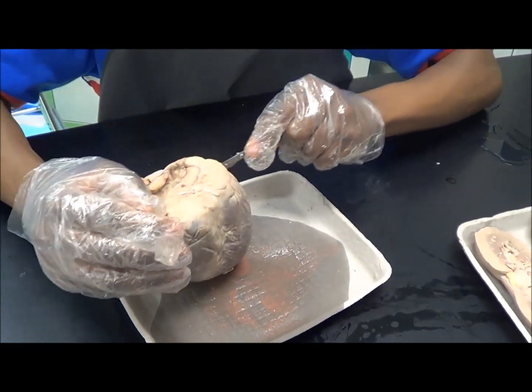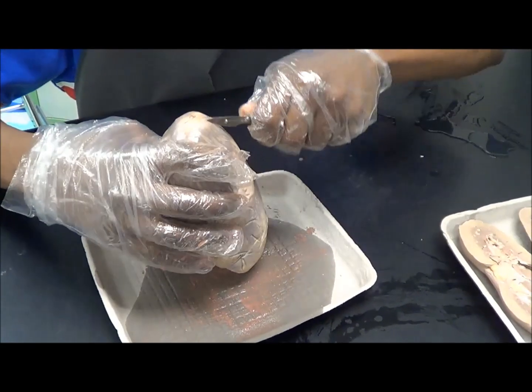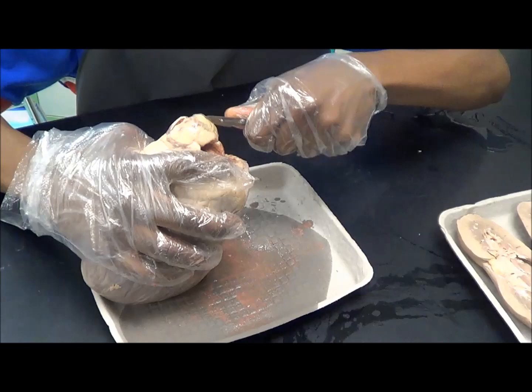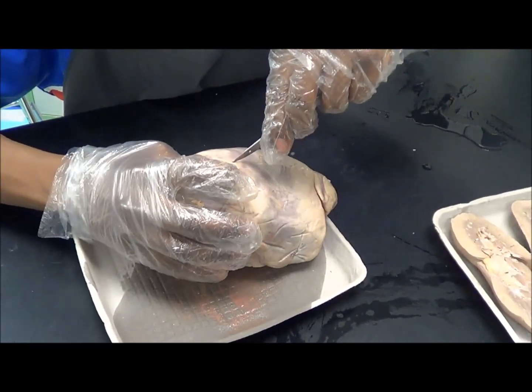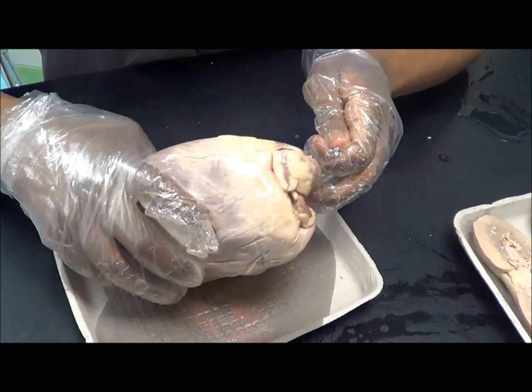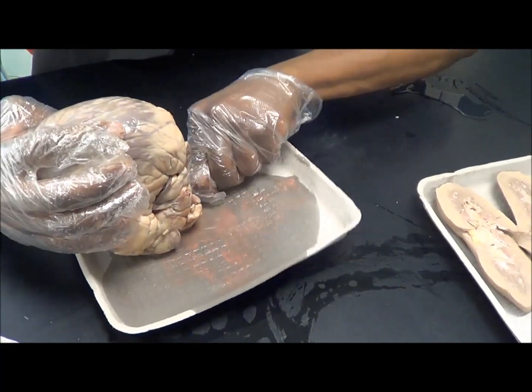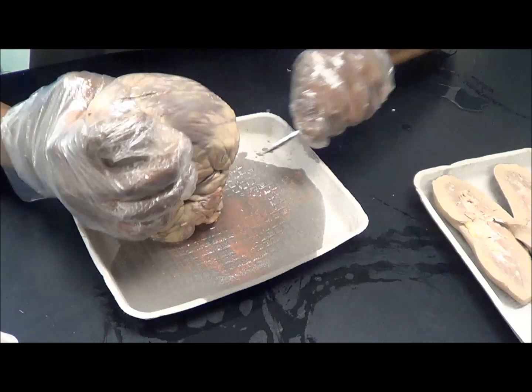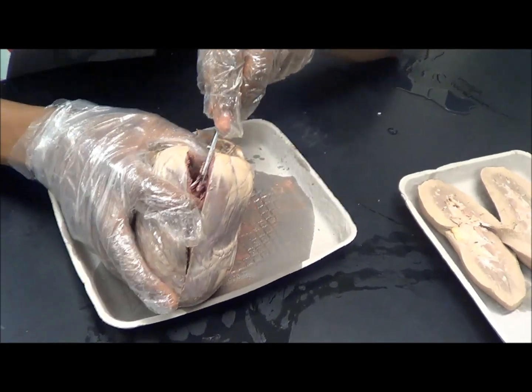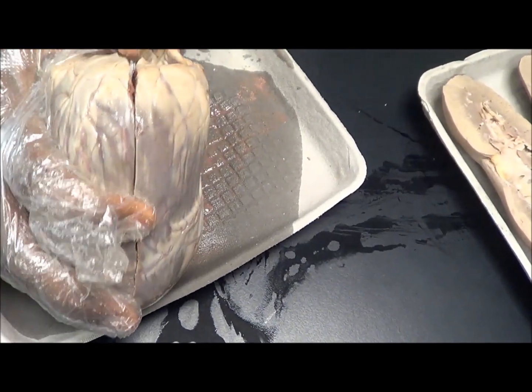So we'll make a cut this in half. I'm doing the right side. Right there you can see the mitral valve and some of the heart strings called the chordae tendineae. I don't want to damage that too much, so I'll just cut right through.